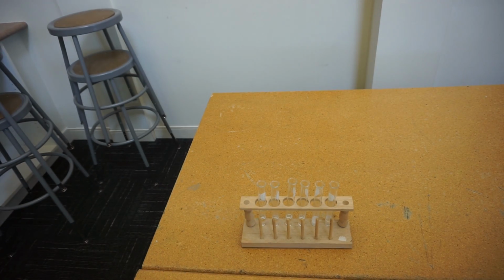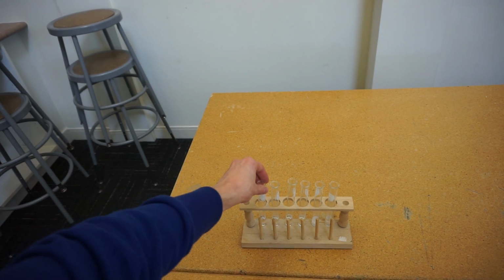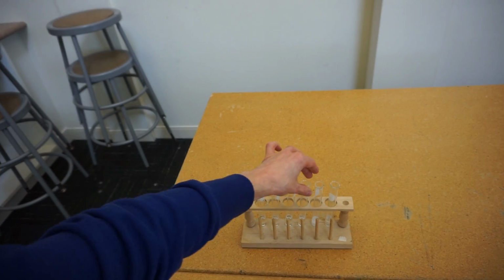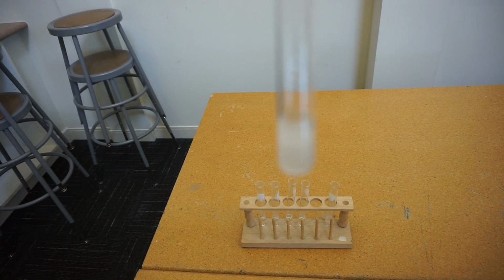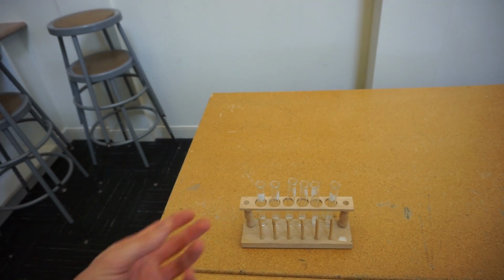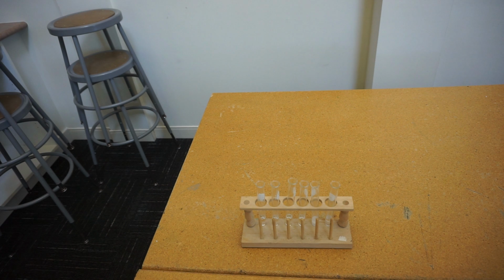So that's what we see. The question then is why? Why were some of the alcohols miscible with water, forming just one liquid? For instance, methanol, whereas some of the other ones that we've seen, we get these two different phases. What's going on and why? And that's the question that I want you to think about for now.